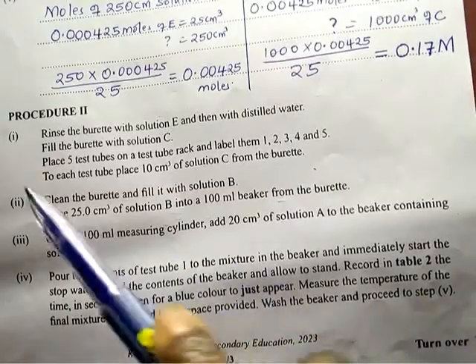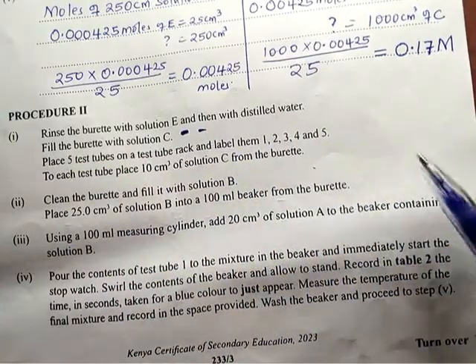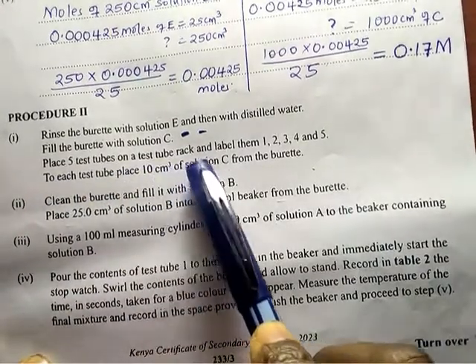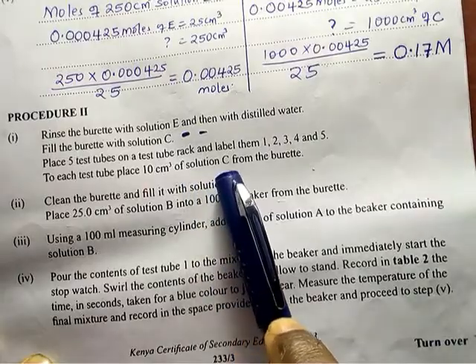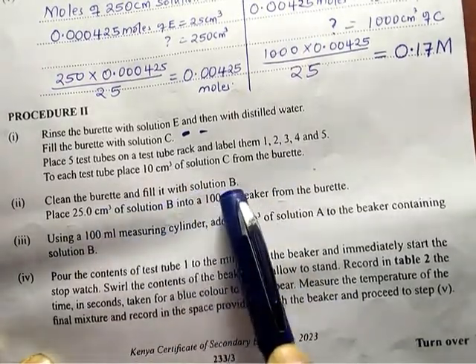So procedure 2, rinse the burette with solution E and then with distilled water. Fill the burette with solution C. Place 5 test tubes on a test tube rack and label them 1 to 5. To each test tube, place 10 centimeters cube of solution C from the burette. Clean the burette and fill it with solution B.